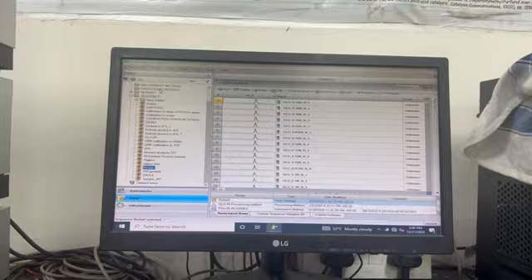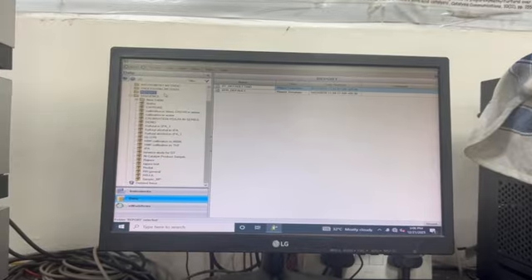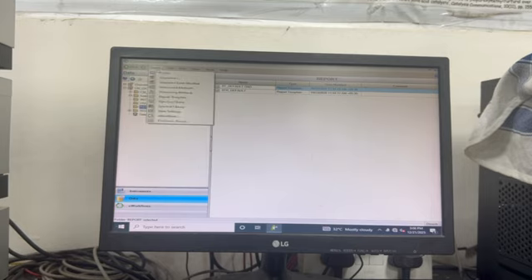Generally there are different report options, and we can use either of them based on our interest, but generally we note down the area. We can do calibration and everything here, but generally we don't do that. We just take the area reading and do it in our own Excel sheet. So these are the major things. Let's start by creating the instrument method, for example.